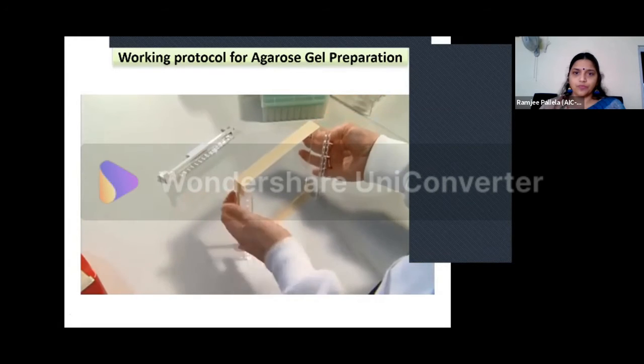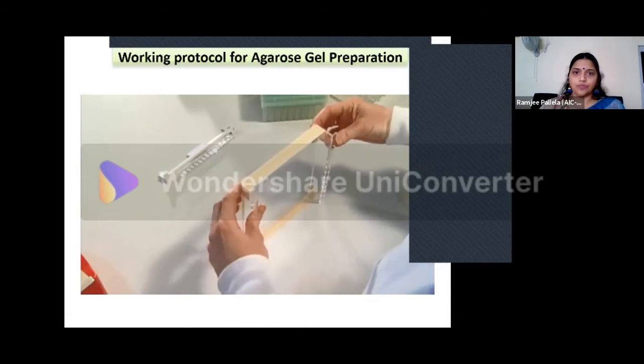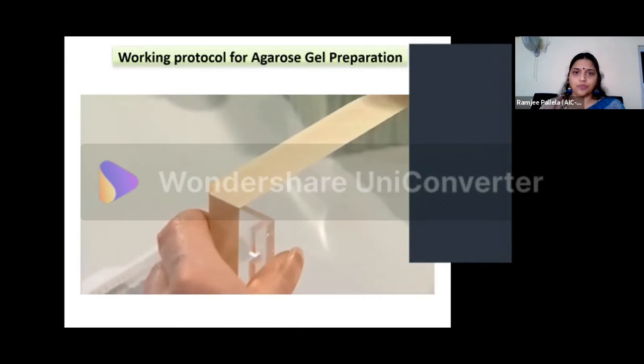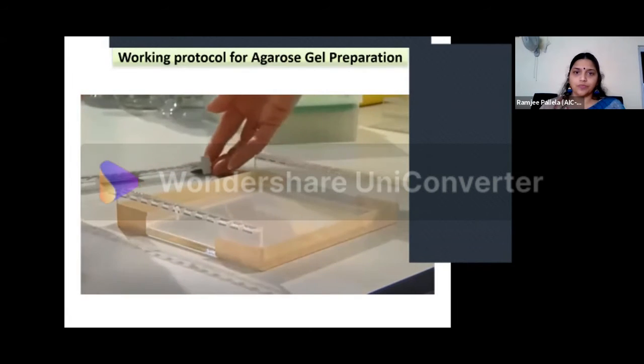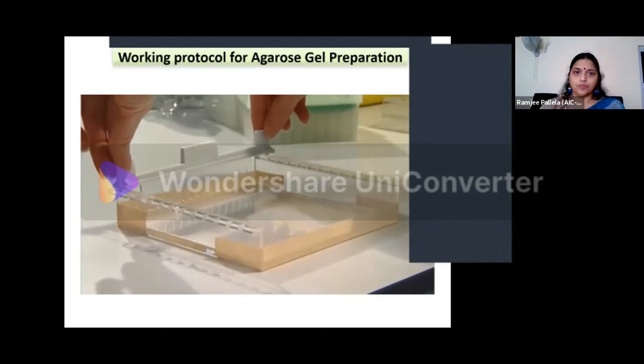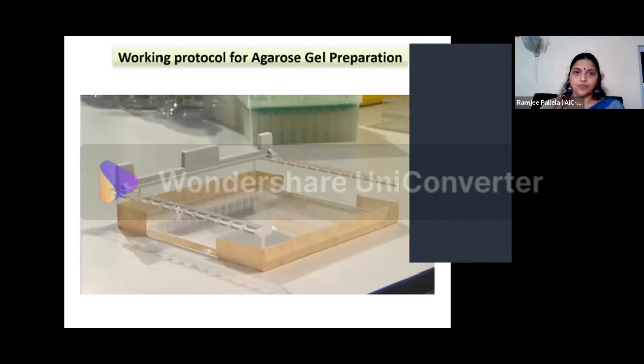Before pouring your gel, you need to make sure the gel tray is on a horizontal surface so the gel will be of uniform thickness. You also need to insert a comb into the gel tray. The comb will create cavities called wells. It's into these wells that you'll be pipetting your nucleic acid samples.